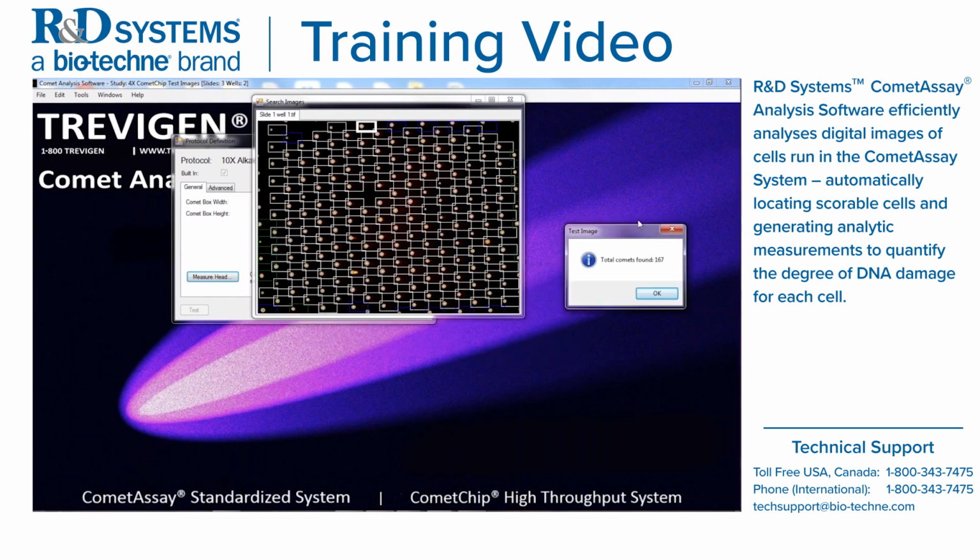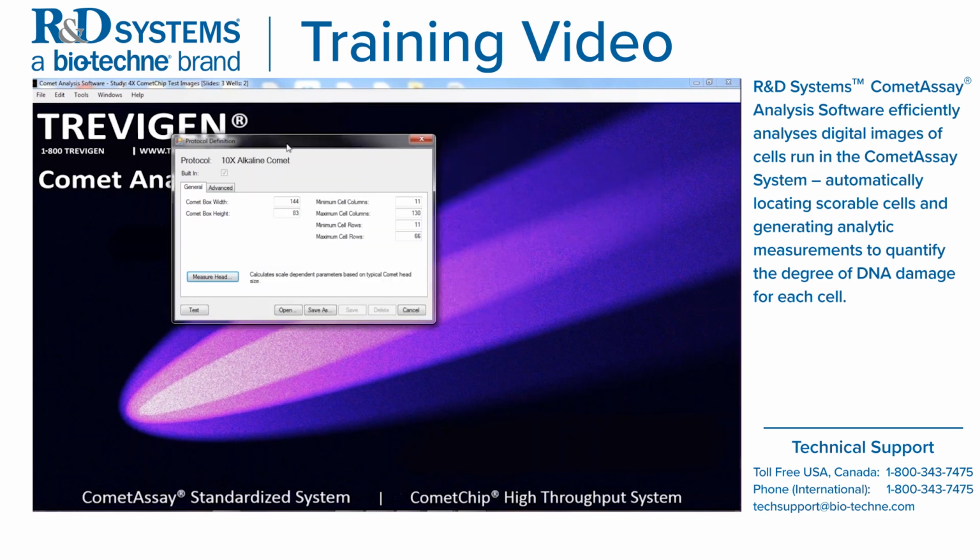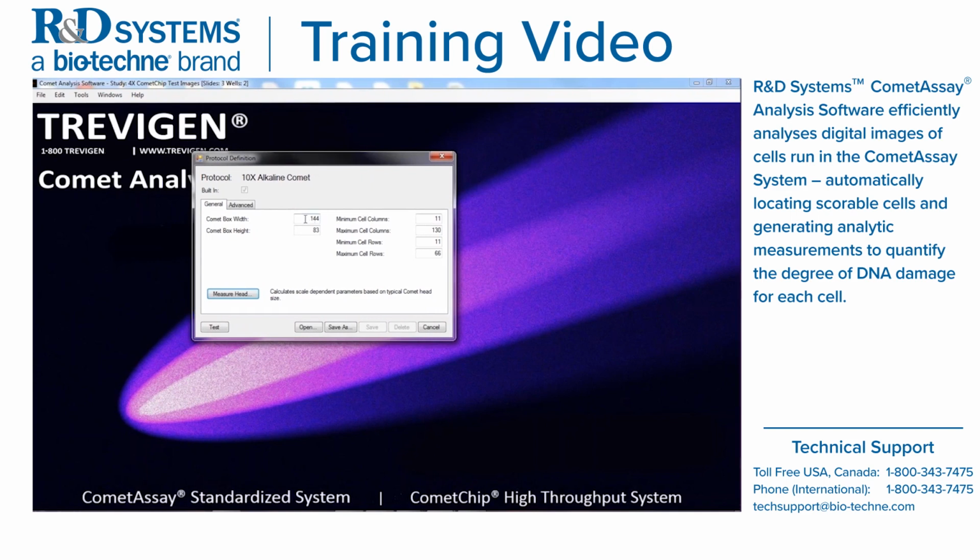All right. So now we have found a total of 167 comets. So this is really good. But you can notice that the boxes are a little large and you're probably losing some data. So you can decrease the size of the boxes. So, okay. So now let's go back to this protocol definition. So all the changes are now here. So let's decrease the comet width from 144 to 115.